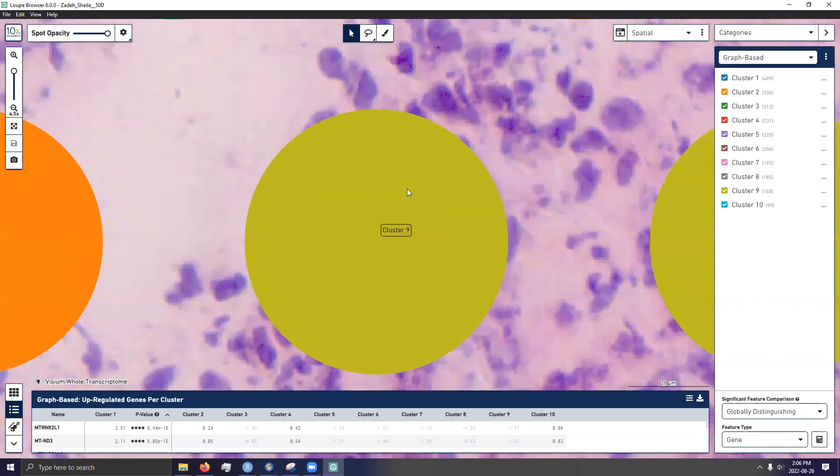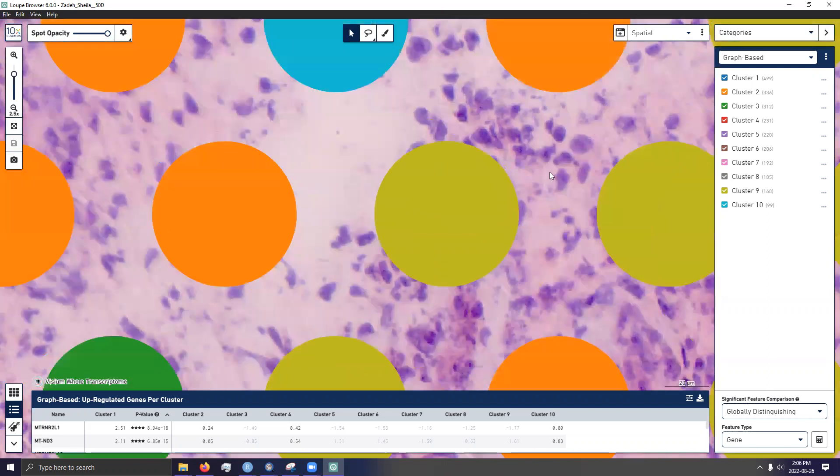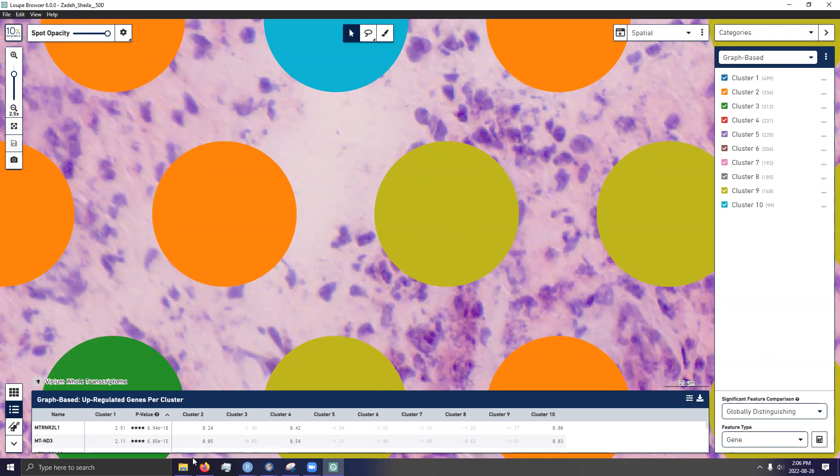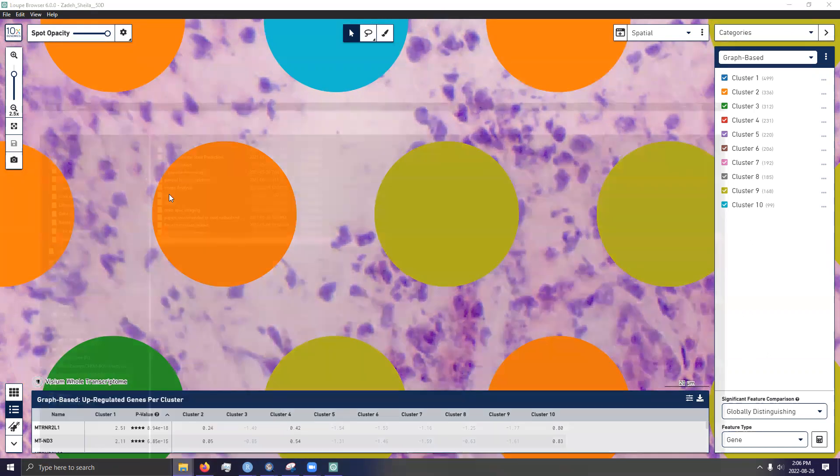The problem with this is, even though it's outside of a spot, it actually may give transcriptomic information that ends up getting sequenced. Now, why is that the case? Well, to understand that, we must understand how Visium actually operates.